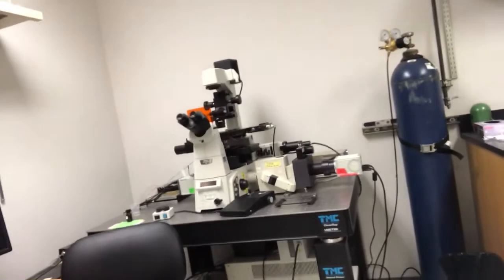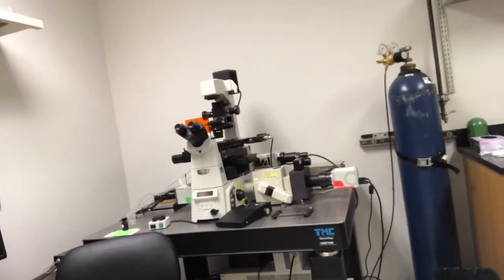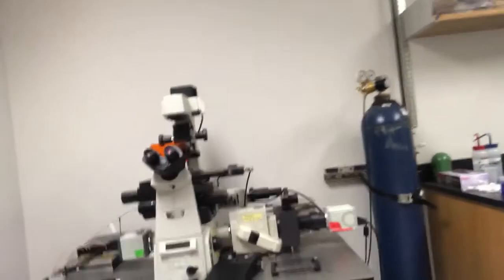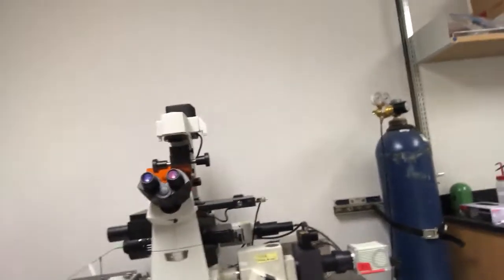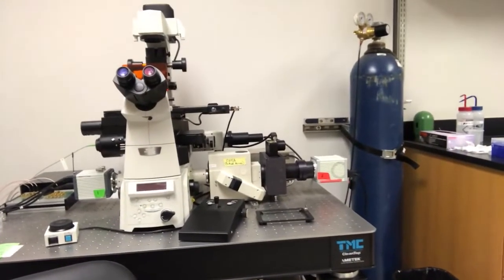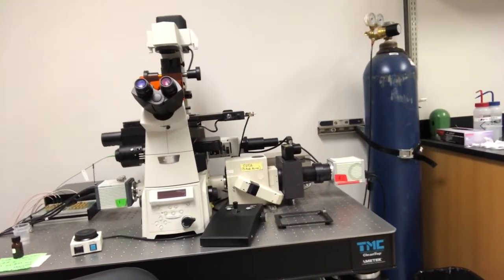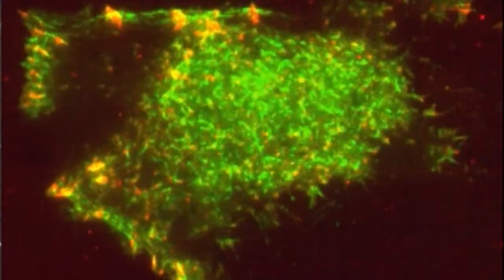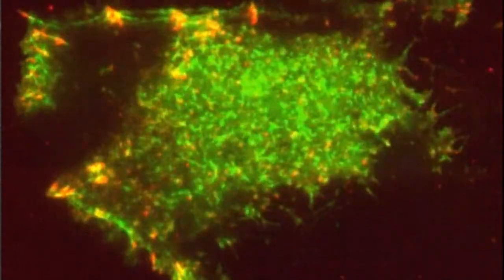This is my baby — the lab's baby, really. It is a standard inverted microscope, but it's fitted with a couple of bells and whistles. On one side we have a setup for TIRF microscopy — that's Total Internal Reflection Microscopy — and that allows us to look at the bottom of cells really closely.